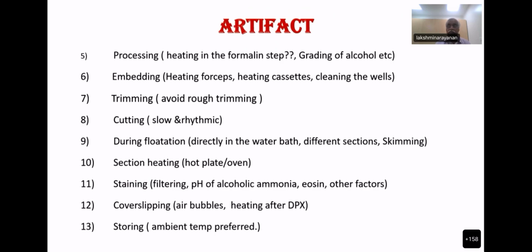Then processing, the heating of formalin, which I again stress, formalin, please don't give heat more than 37 degrees at any cost. And I have seen many laboratories doing that, boil the formalin and then put the tissue. You won't believe this statement, but I have seen it myself.